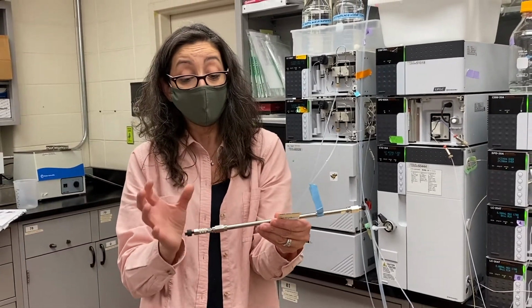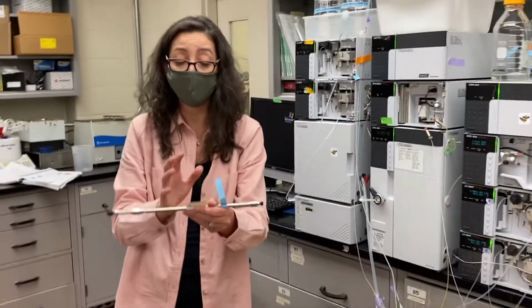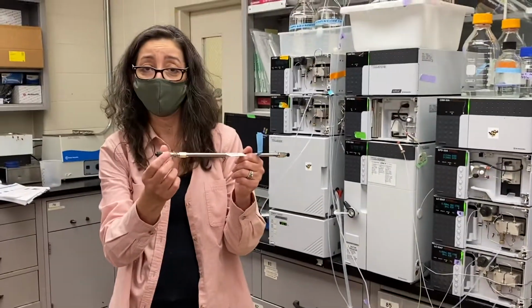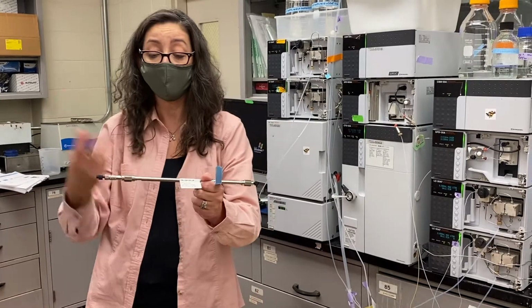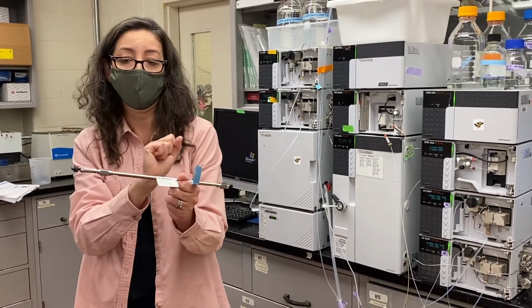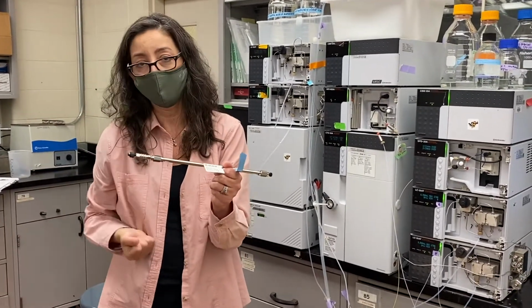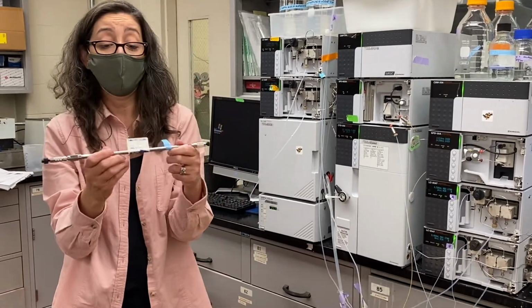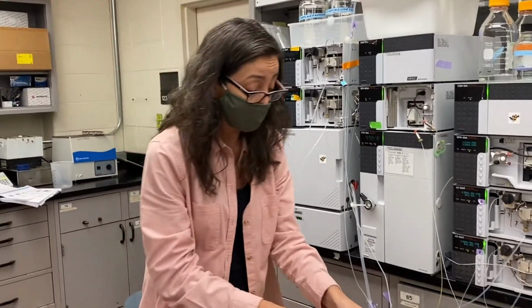So then the other thing, the difference with the GC, is the column you'll see is very different. The capillary column is very, very long. They don't use a guard column. Why? Because actually in GC, after injecting several samples, they cut the column. So they cut the front of the column because the front of the column would be more contaminated with impurities. But you can't cut my column. Yeah, that is not possible. And I don't accept doing that.